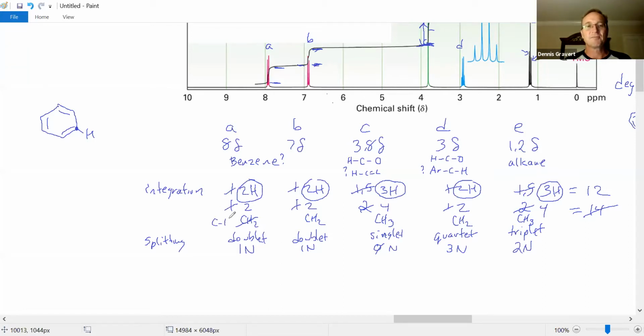So one way to get a hydrogen to have a peak at position 8 is to attach it to a benzene ring. And that means if there's two H's, I've got to have a plane of symmetry either here or there or somewhere to make it symmetrical.